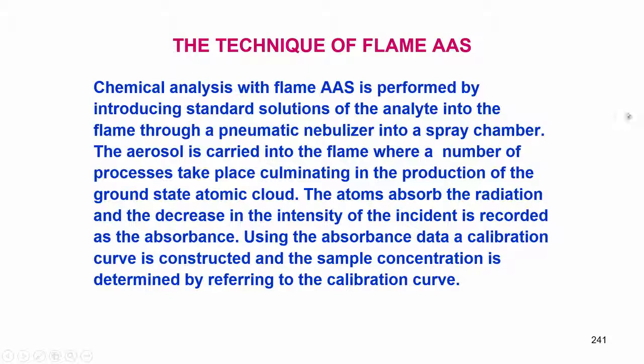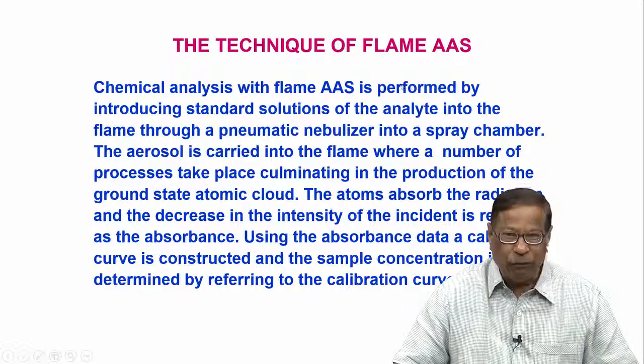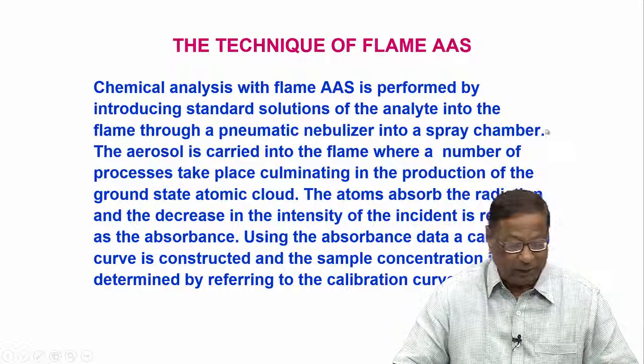As I told you earlier, there are about 4 systems of atomic absorption spectrometry: flame atomic absorption, graphite atomic absorption, hydride generation, and cold vapor mercury. Now we are going to discuss the technique of flame atomic absorption spectrometry.